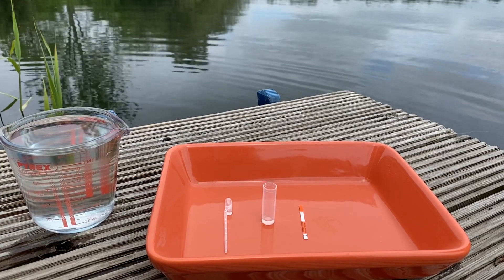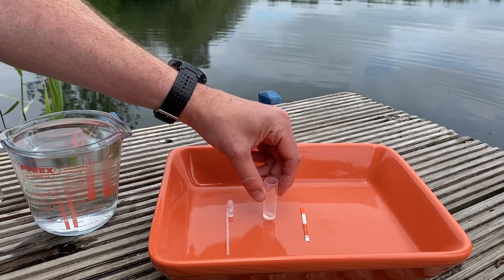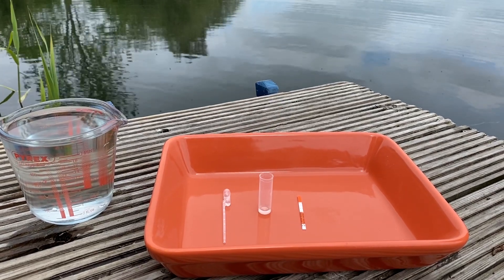So once we've added our single pipette full of water, we just need to give it a little swirl so it mixes with that reagent, and then we'll let that stand for five minutes.